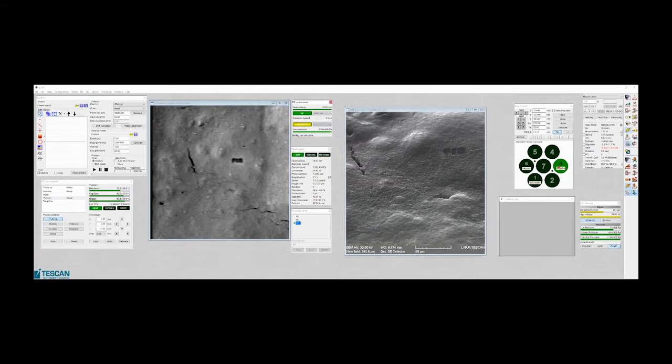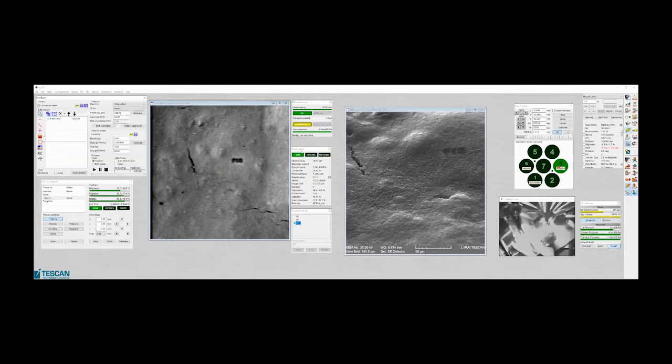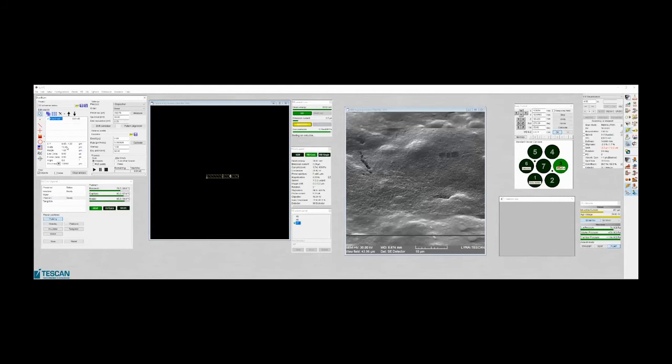It's this Lamella Preparation. So you can save all your process about the lamella, how you create it. So for example, here you open it and, okay, I will go closer. And here it's the protective layer. When you click on it, you have already 4 parameters like the size, the thickness.